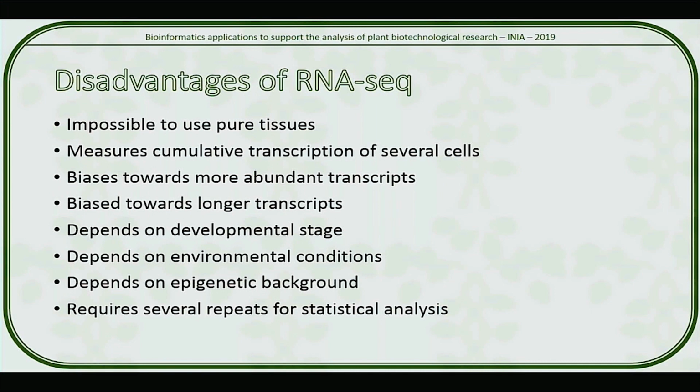What are the disadvantages? There are a lot more disadvantages, or caveats, in RNA-seq. First, it is impossible to use pure cultures so far. Technology is improving. We may be able to do it someday. But currently, yes, it is impossible to use pure tissues.